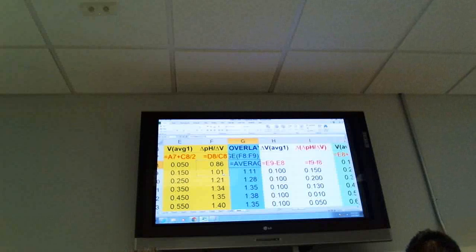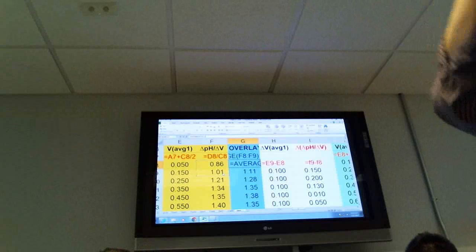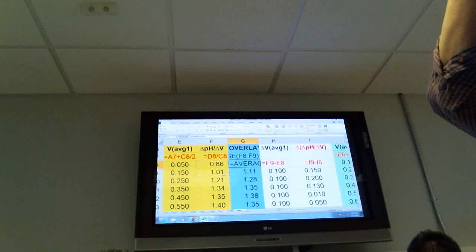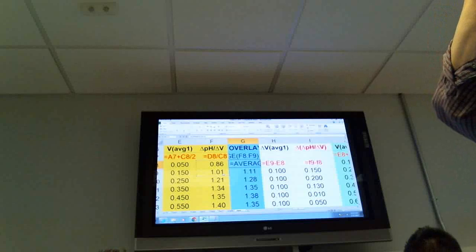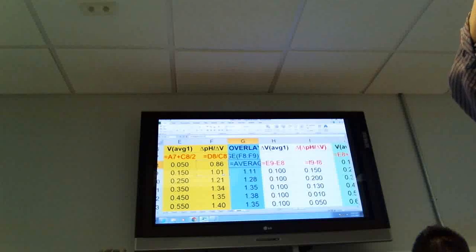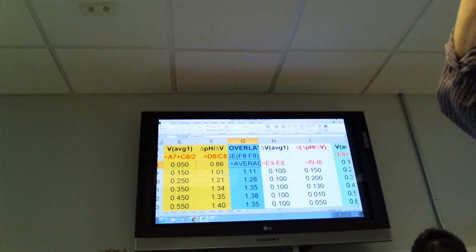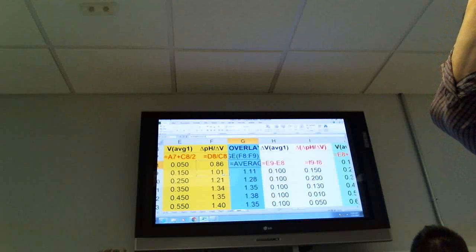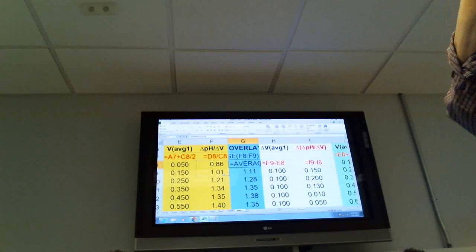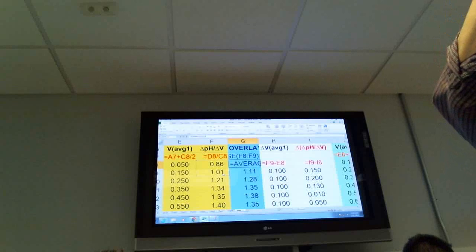Okay, so this is what's happening here, if you can imagine this. The pH titration is here. The first derivative is offset, right? Now, if I want to overlay them, I have to offset either the slope or the pH. And so what I did was I left the pH there and then offset the slope.